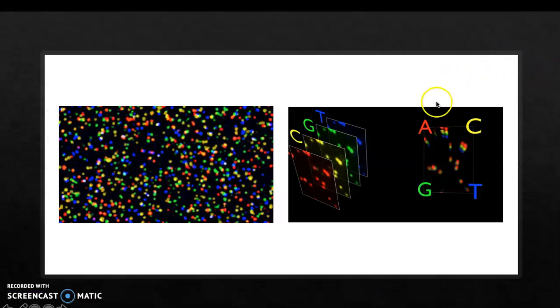This right here shows a picture of what an Illumina plate looks like when one burst of light is sent out. And so basically it can take these individual lights, and they'll change each time a nucleotide is added on. So all of these lights represent a different piece of the DNA that we originally put in. And then it'll take these pictures and stack the lights on top of each other. So this is kind of a bad example because it makes it look like every piece of DNA has a sequence of T, G, C, A, but it gives you an idea of what's going on.